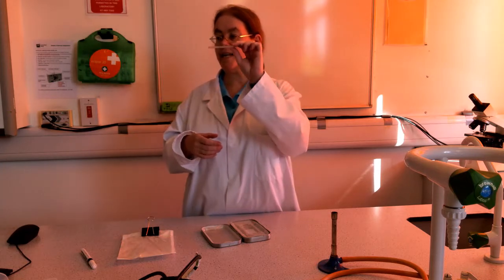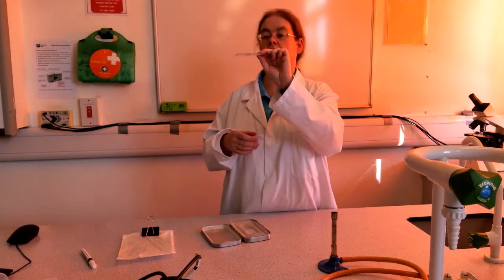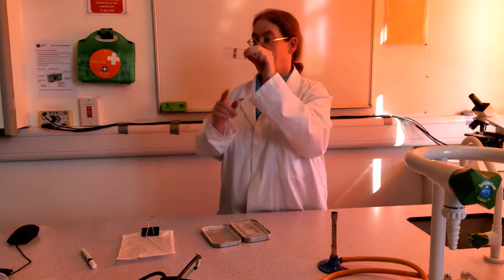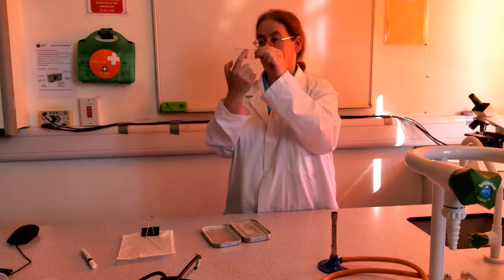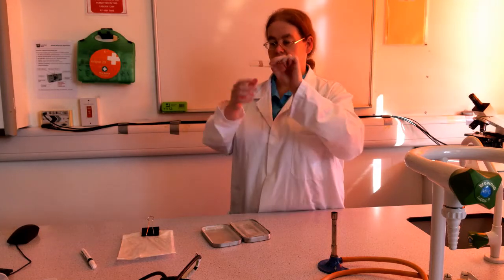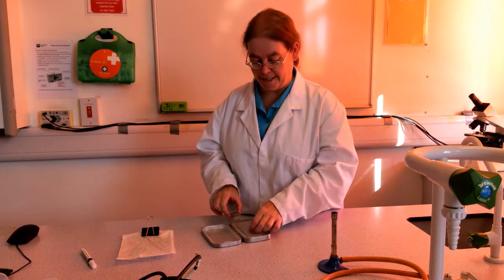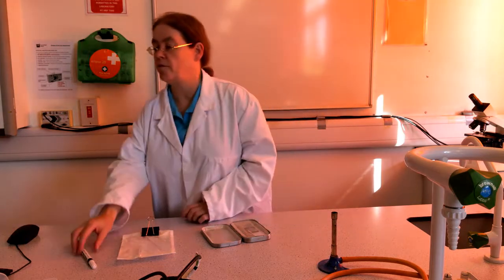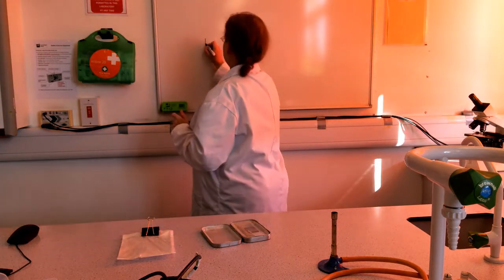As you can see, it's way thicker than a normal microscope slide, and it has a sort of H shape on it. I know you can't really see that from there, and while I'm on my own I can't zoom in because this camera doesn't come with a remote, so I'll just draw you a little sketch.